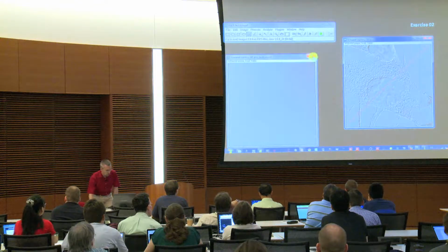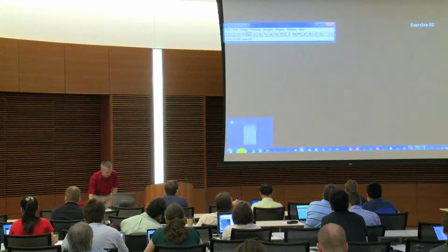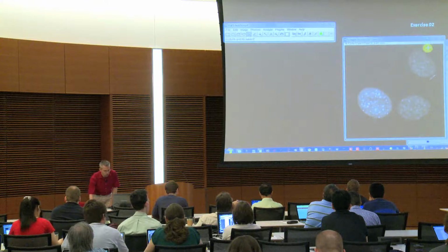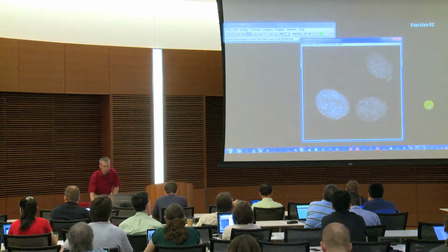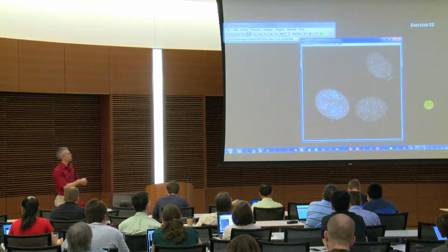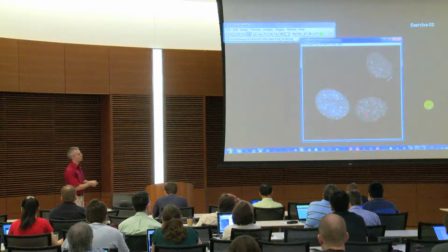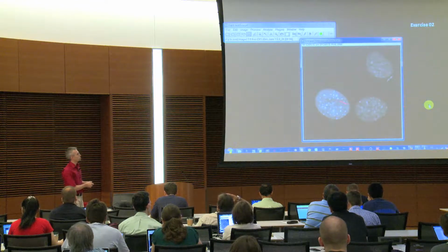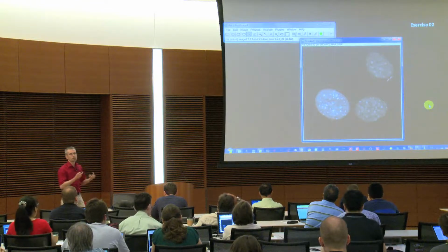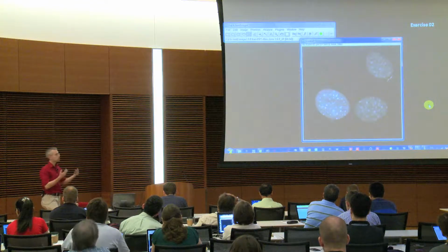This is also helpful not only for those kinds of images. I'll just show you quickly in the same exercise there is also a fluorescent image, because for feature extraction we often might have the problem that in an image some features are naturally bright because they have a lot of fluorescent information or material, and some others are dark. Now if I want to extract those spots from all those three objects here, I'm kind of lost, because with the same threshold I will not get them out.